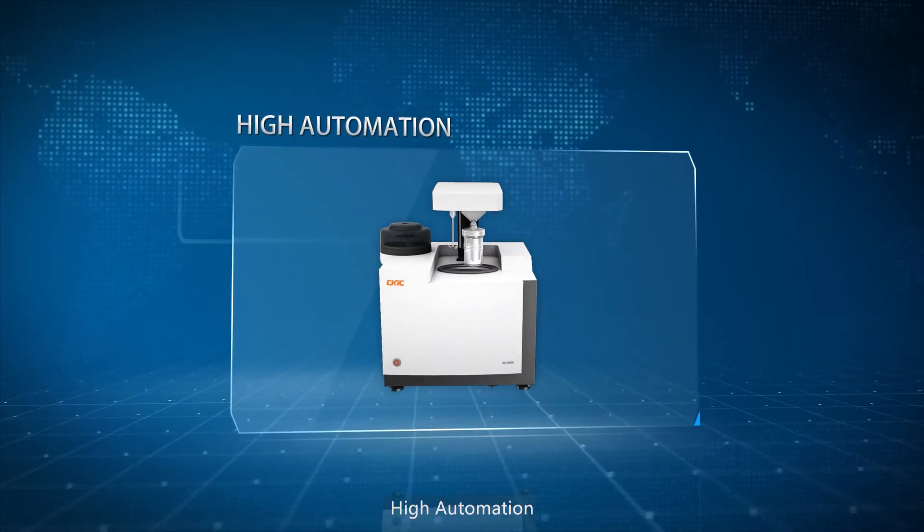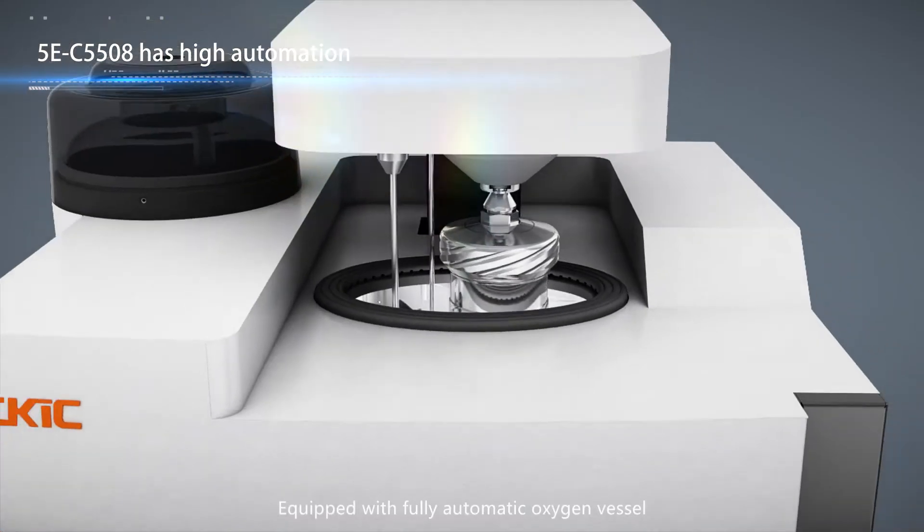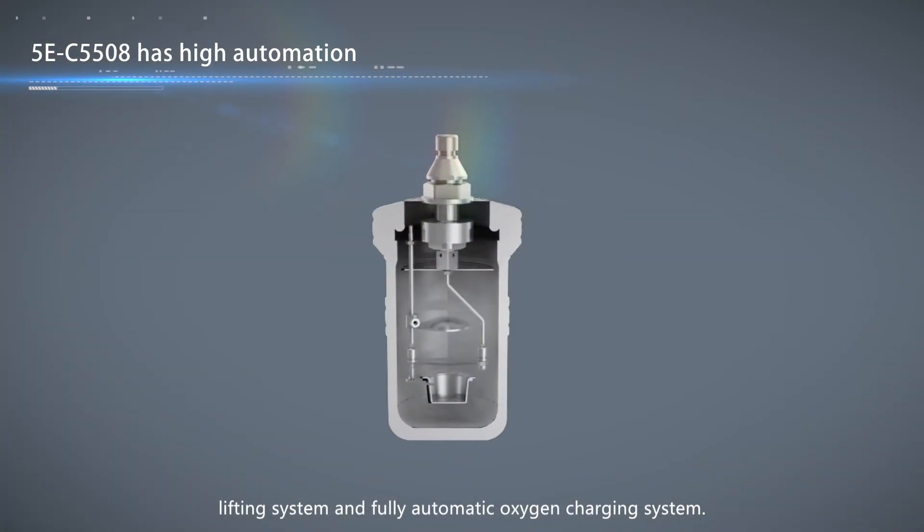High automation: equipped with a fully automatic oxygen vessel lifting system and fully automatic oxygen charging system.